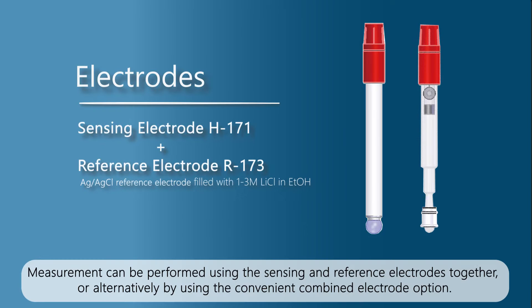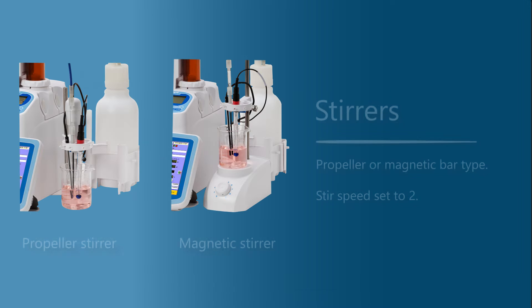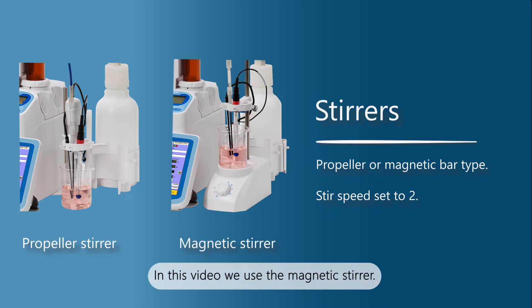Measurement can be performed using the sensing and reference electrodes together or alternatively by using the convenient combined electrode option. In this video we will be using the C173 combined electrode and the magnetic stirrer.